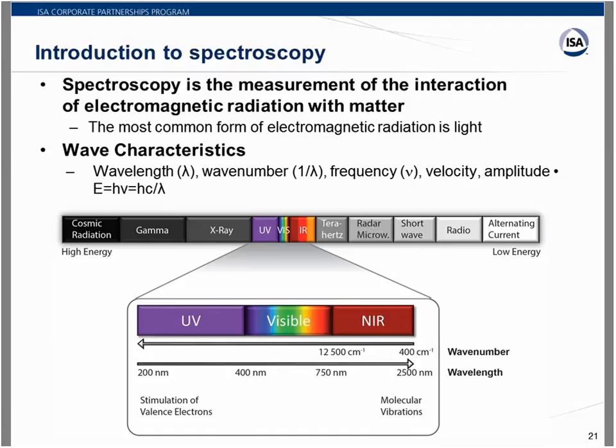As you see in the graphic below, you usually have this entire range of electromagnetic radiation, but we usually focus on the UV-vis, near IR, and occasionally the mid-infrared regions, which will actually tell us a lot of information about the chemical structure, about your entire solution, about your entire matrix. Within this presentation, you may hear us use certain terms like wavelength, wave number, frequency. All of that will just tell you a little bit about the energy of the light that we're working with.